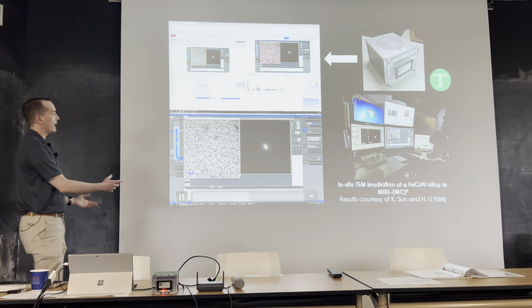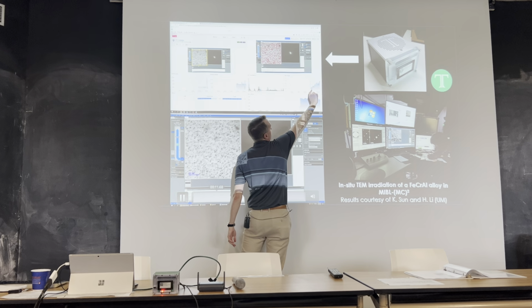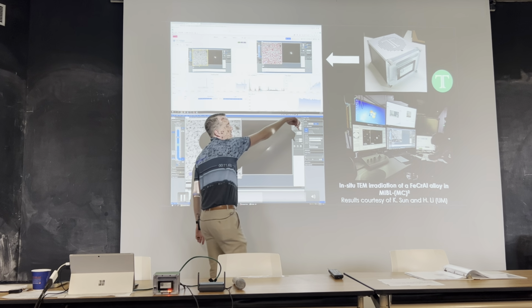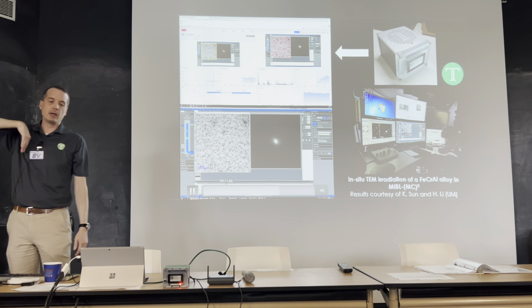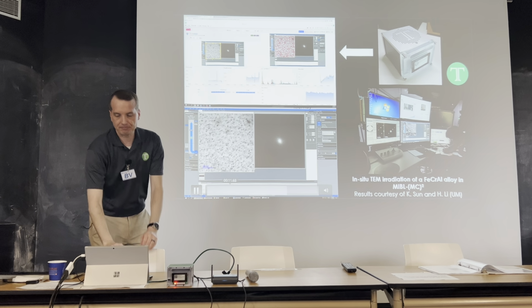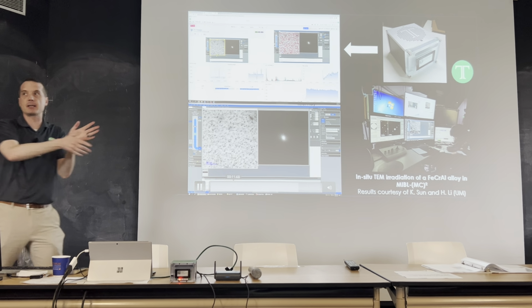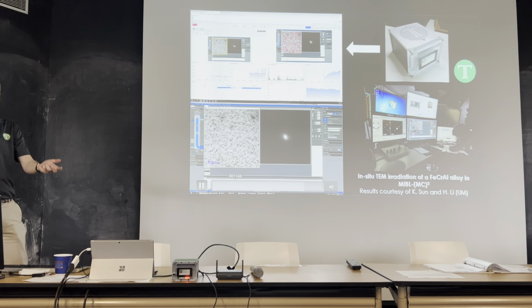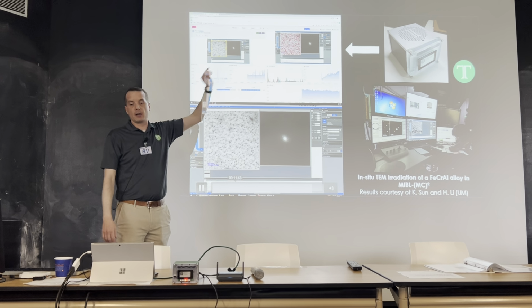And what they want to know is this one, it's a little fuzzy there, but is that increasing? Is it decreasing? Basically, am I getting more defects or less defects as the radiation is impinging onto the sample at that point? Right, so they're getting that answer. That's the discovery. That's their interpretation. That's what they're trying to figure out. Is it a good material or bad material? That took them 2 years before. They're getting that now at the microscope.